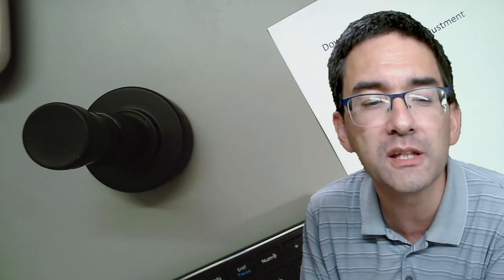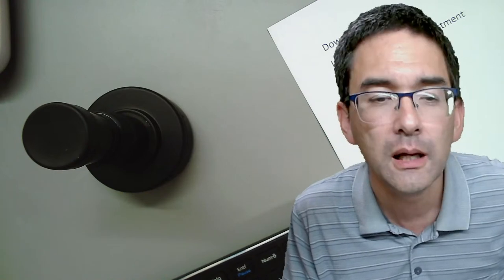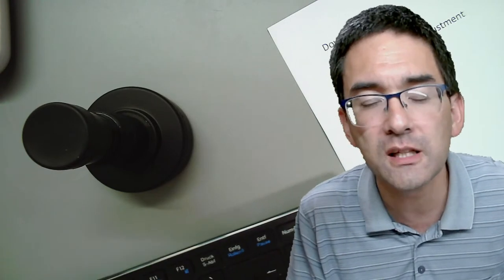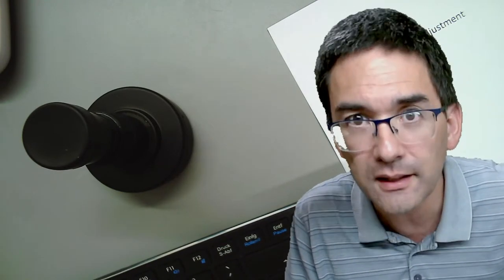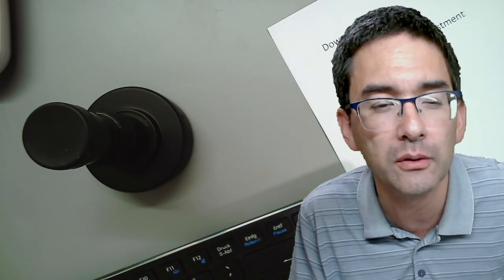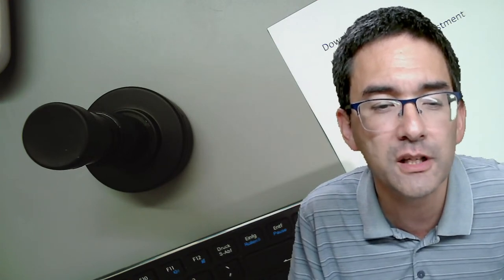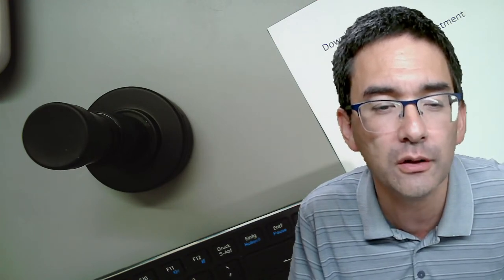So I've got now an exposure time of 3.6 milliseconds here, and of course, if you have an exposure time which is, let's say, 1 second. Because you went all the way up to, I don't know, now 2,000 milliseconds is 2 seconds, okay? If you've got an exposure time of, let's say, 1 second over here, yeah?